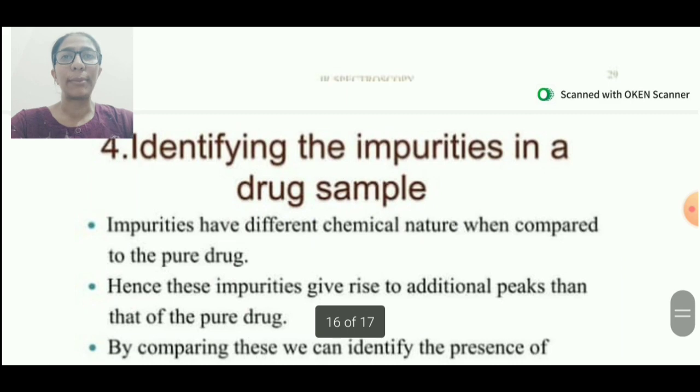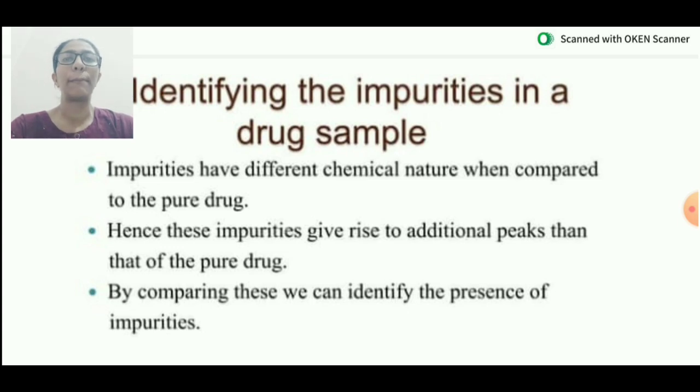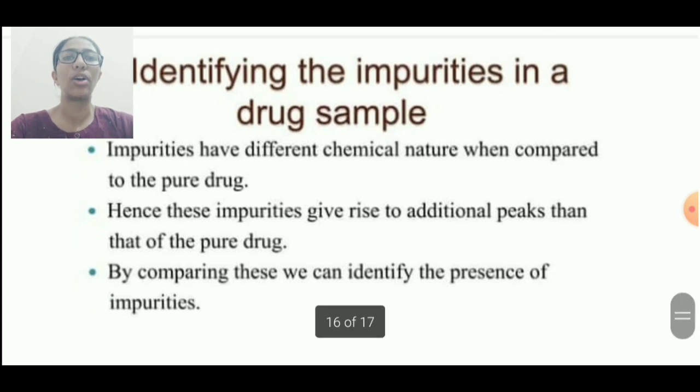The fourth application is identifying impurities in a drug sample. Impurities have a different chemical nature when compared to the pure drug. Hence, these impurities give rise to additional peaks compared to those of the pure drug. By comparing these, we can identify the presence of impurities.